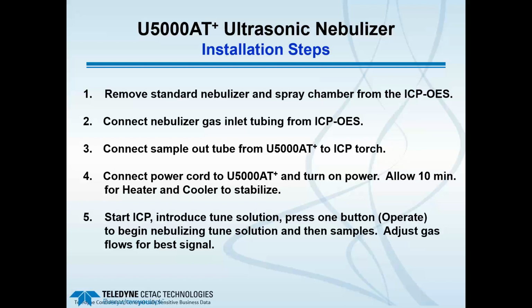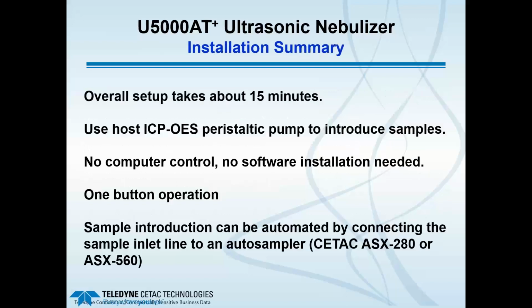Then simply start the ICP. Introduce your tune solution, press one button, the operate button on the front of the unit, to begin nebulizing tune solution and then samples. And adjust gas flows for best signal, primarily the nebulizer gas flow from the host ICP. Overall setup only takes about 15 minutes.